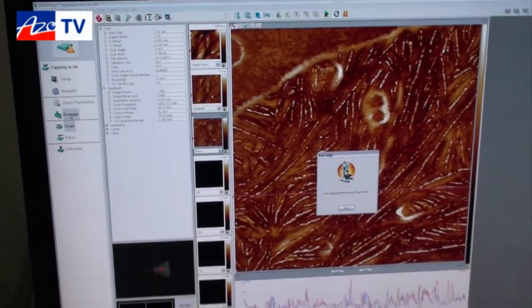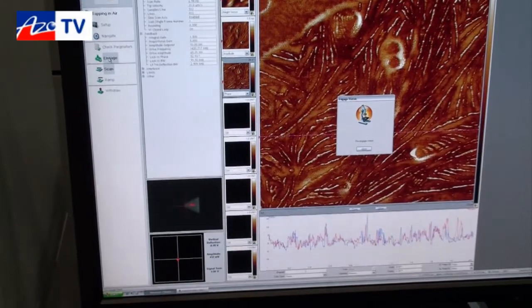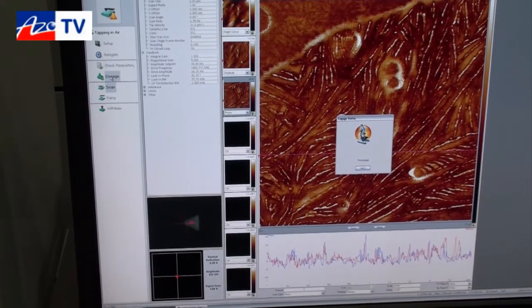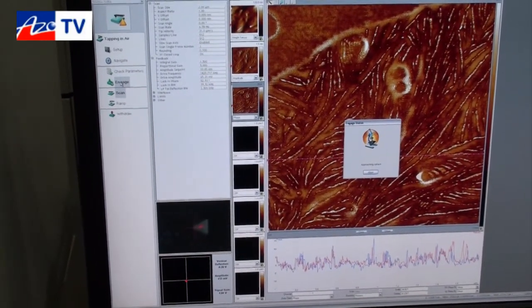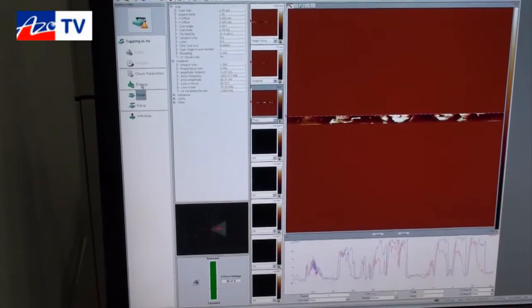There are a few things that are different about this specific system. One is the probe, which you can see here in the optical image. The probes are shorter cantilevers than normal — they tend to be about 30 microns long, silicon nitride with sharp silicon tips. That means they're designed to respond very quickly, much faster than a standard probe, which allows you to scan at very fast rates.